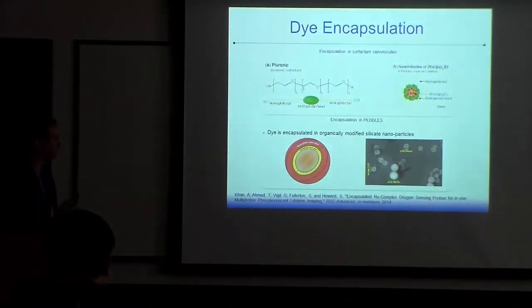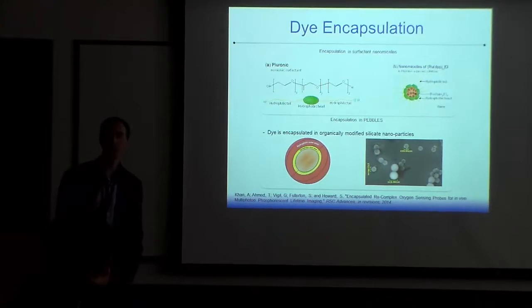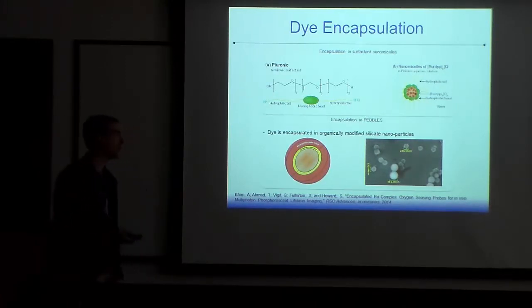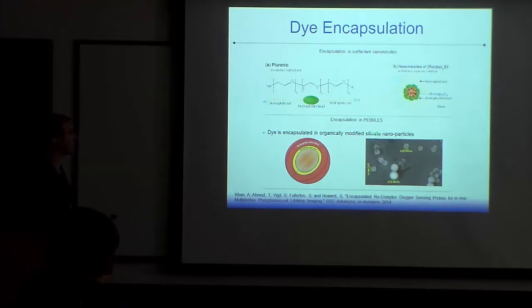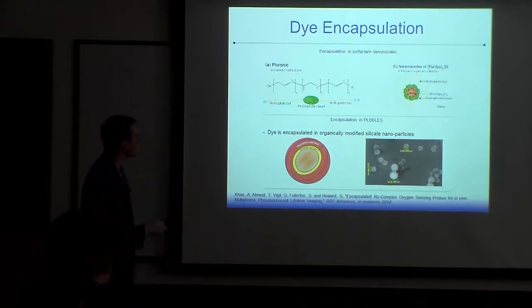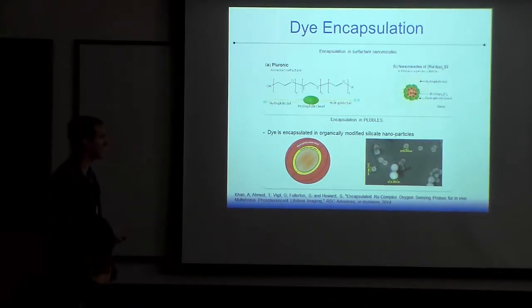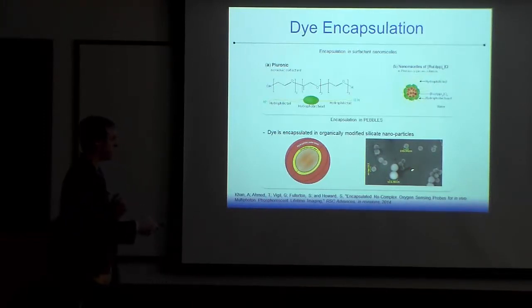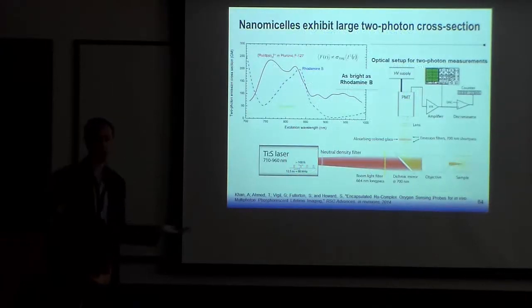Now I guess we'll wrap up by showing some things we're working on: trying to make these nanoprobes or nanoemulsions so we can measure dyes. There are some common oxygen-sensing dyes out there that are not water soluble. If you surround them with some surfactant, which is what we're doing here, the dye becomes water soluble, with hydrophilic fingers sticking out so it can float around in water. Another way is to make silica cages about 200 to 400 nanometers in diameter. We load dye in the middle, and oxygen is permeable through the silicate cage, so we can use those as dyes.